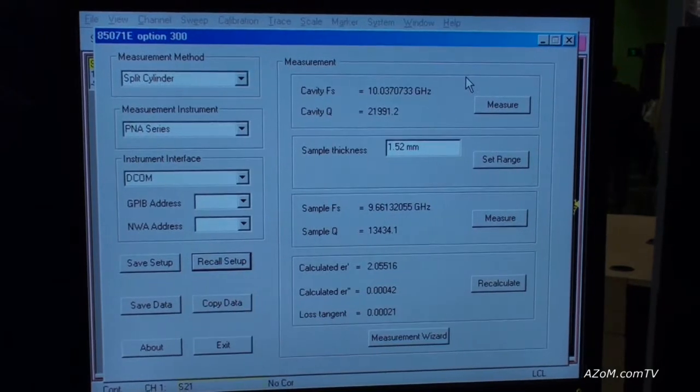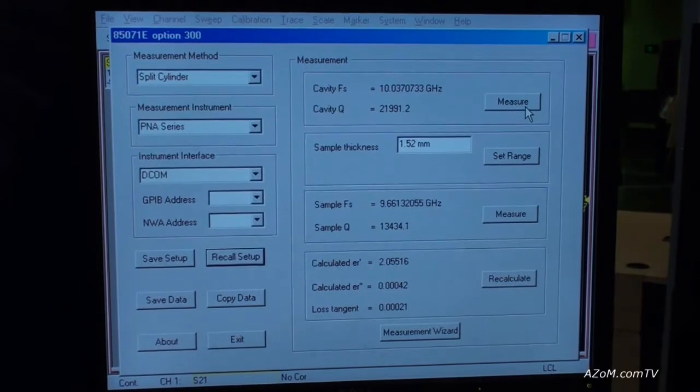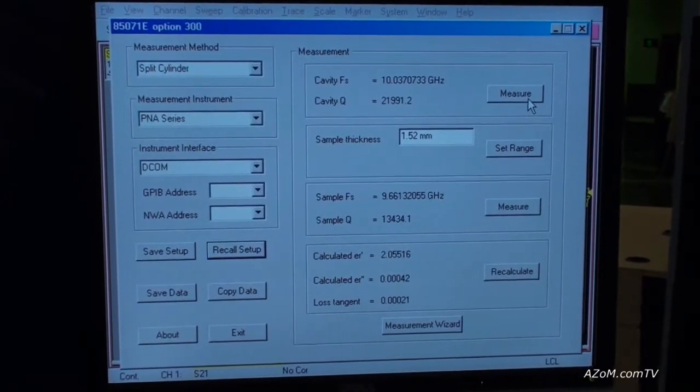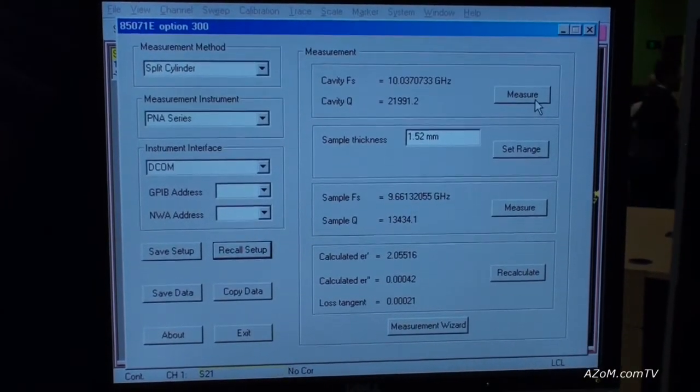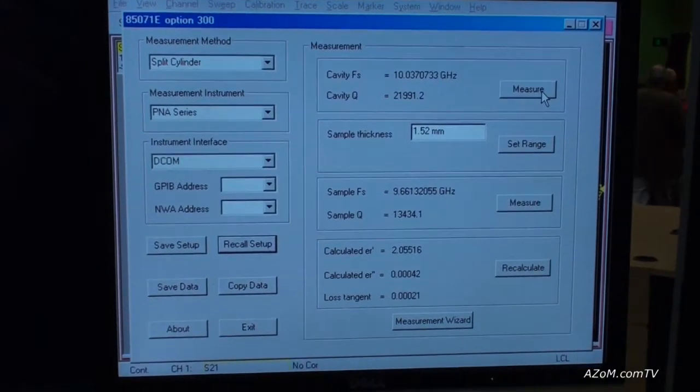I've made a measurement here. The first step is to measure the fixture closed. So we have a frequency close to 10 gigahertz and a Q, which is quality factor, over 20,000.